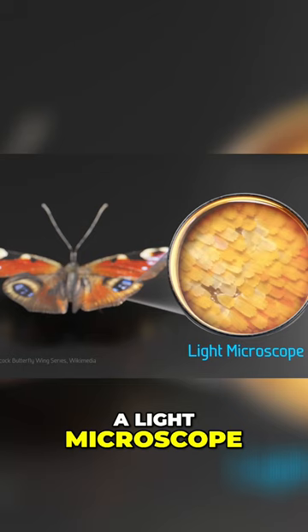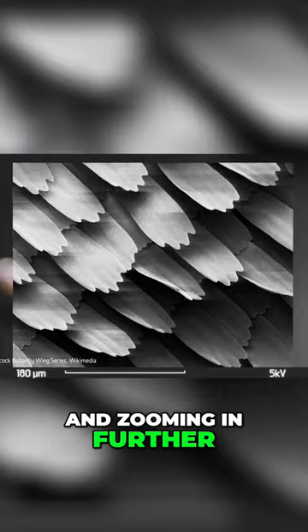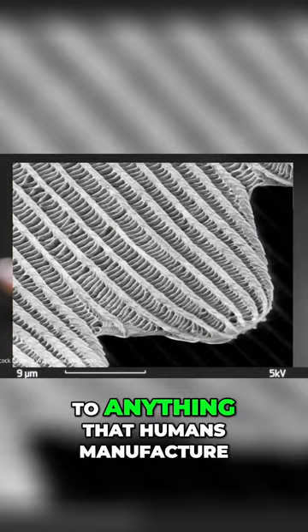But when we zoom in using an electron microscope, we can clearly see the shape of each scale. And zooming in further, we see how the scales have a truly incredible texture entirely foreign to anything that humans manufacture.